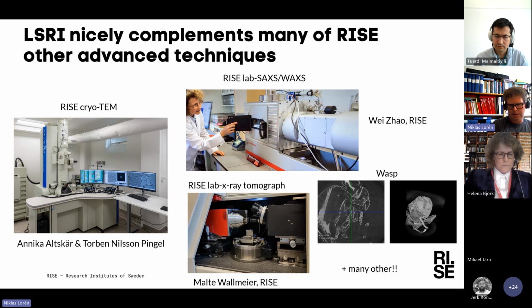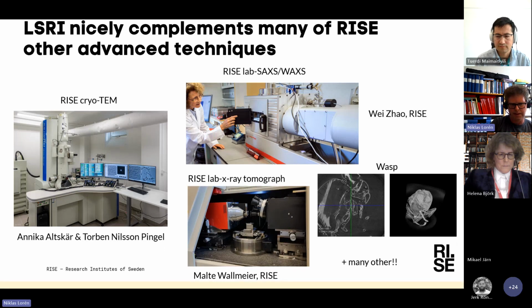And then we also have nice X-ray tomographs in Stockholm. Vei and Malte are responsible for those, and Malte sent me two pictures where he had imaged a wasp, which you can see on the right side here. But of course, we have many other techniques that complement these very nicely. So I think it really fits nicely into the toolbox that we have at RISE.